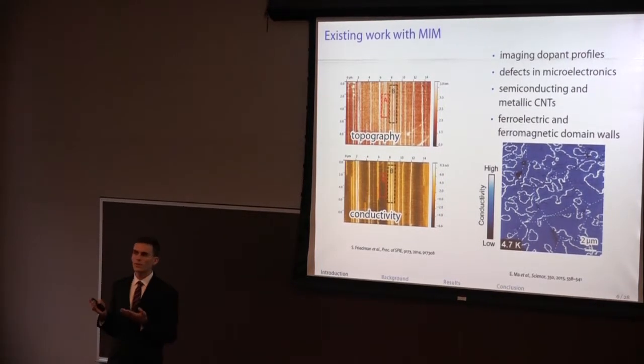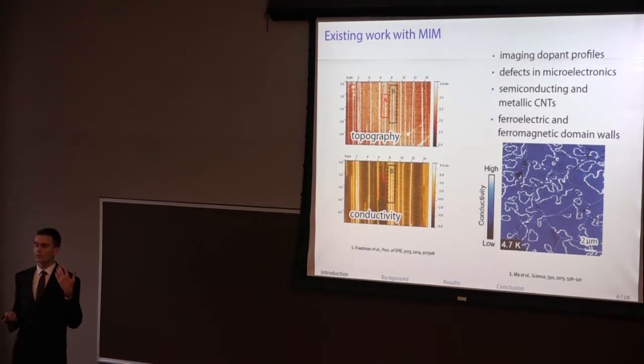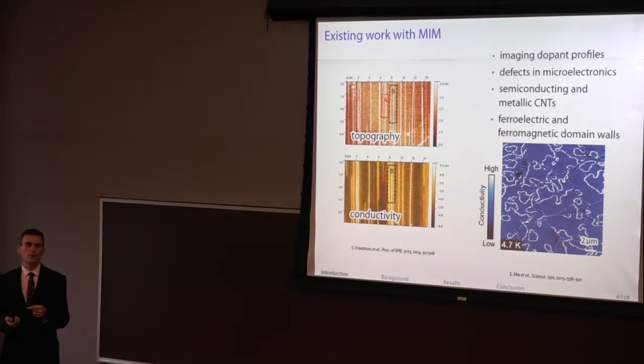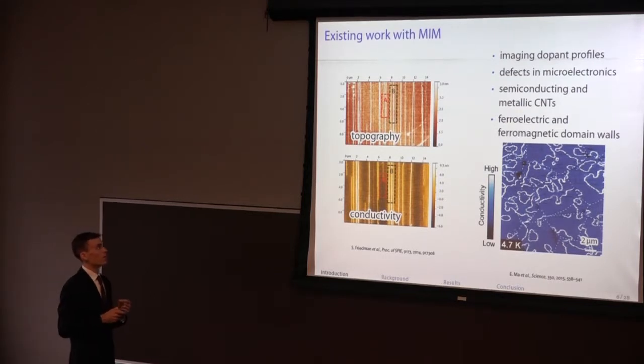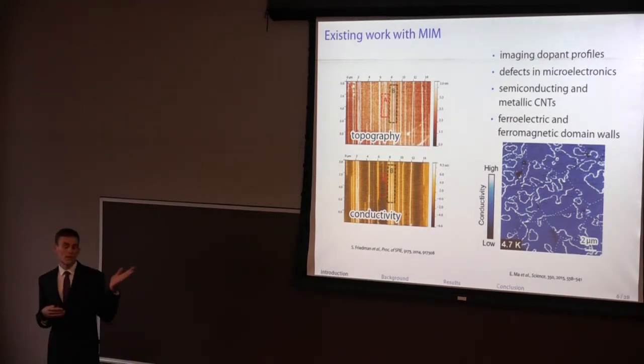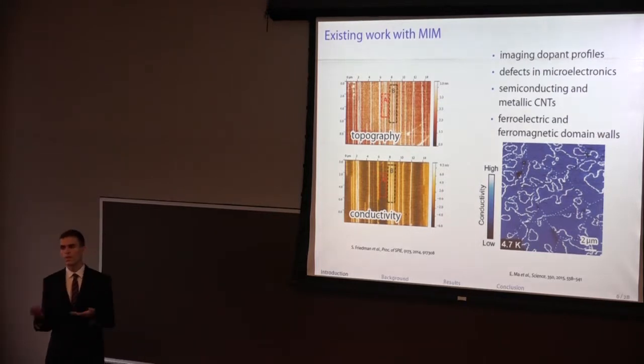And discerning between the two can be somewhat elusive just because there's no change in mass or chemical composition or anything like that. But with this scanning technique where we're measuring conductivity point by point along with the topography, we can image these individual nanotubes like in the A and B regions. In the A region we see a very low conductivity. In the B region we see a higher conductivity. So in this study, they've been able to differentiate very easily between the two types of nanotubes here.